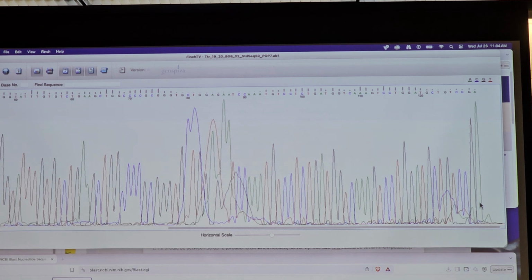So you lost 20 because of the primer, 10 first nucleotides, now you're down 30. So you're probably going to get 120 nucleotides in sequence at the most, right? And again, here, if we get 100 nucleotides of sequence, or even just 50 nucleotides, it's enough to see that it's TTR. We don't need the whole sequence. In fact, we only amplified really a small part of the gene.